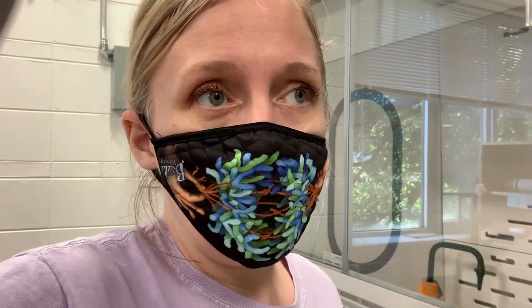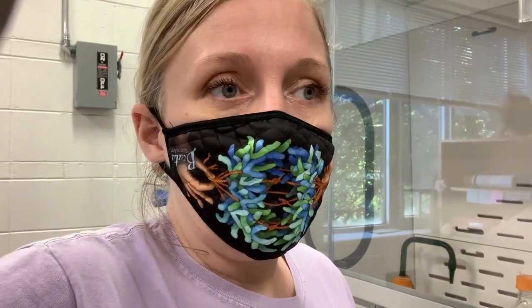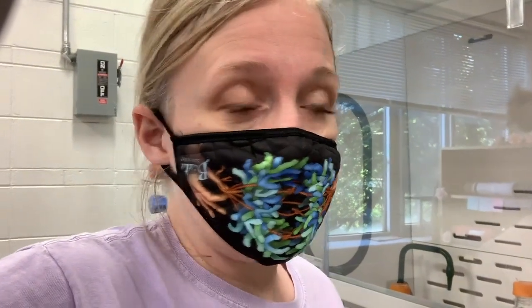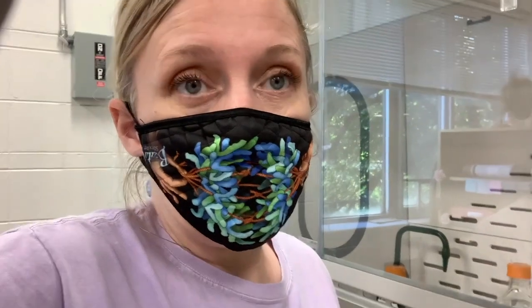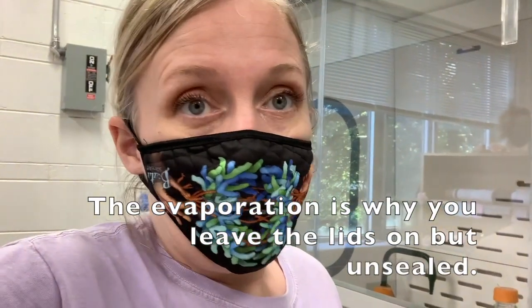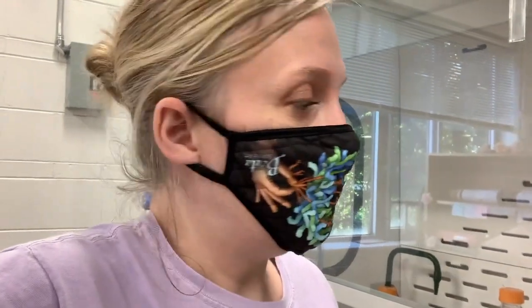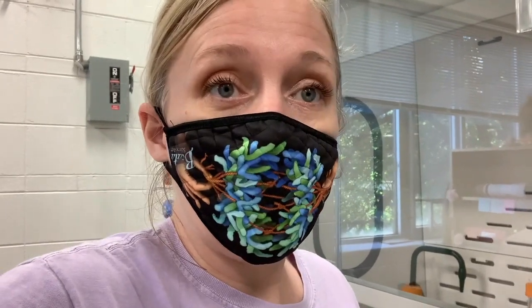So tomorrow, after an overnight incubation, we will autoclave these solutions. That will cause evaporation of any ethanol that's come from the Dep C as it's degraded and get rid of it. So your solution won't have this chemical in it anymore after autoclaving, but it also won't have any active RNases in it. So that is the end of this part of the video. We're going to leave these to treat overnight, and then we'll talk about autoclaving tomorrow.